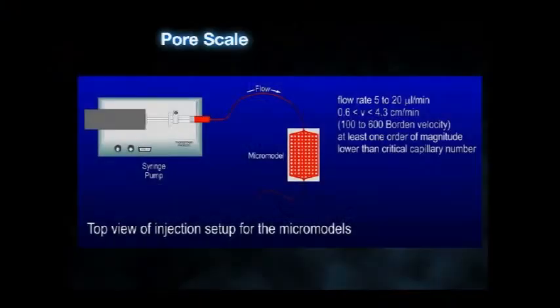in phase behavior. I'm going to show you the experiment so you can understand what happens. We have here a syringe pump, where we're using a very low flow rate, where we can pump through this micromodel. A micromodel is a model that is etched in glass.